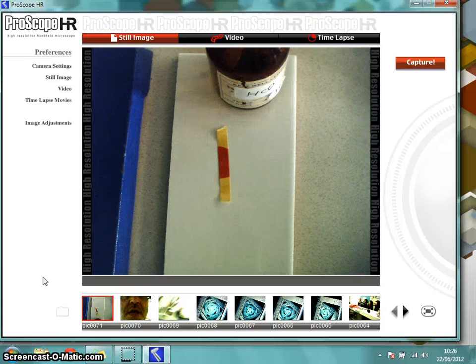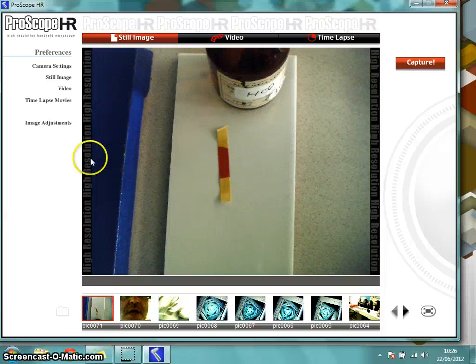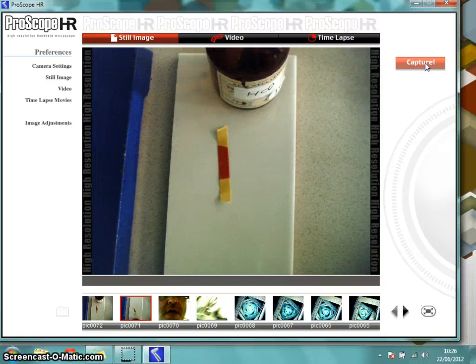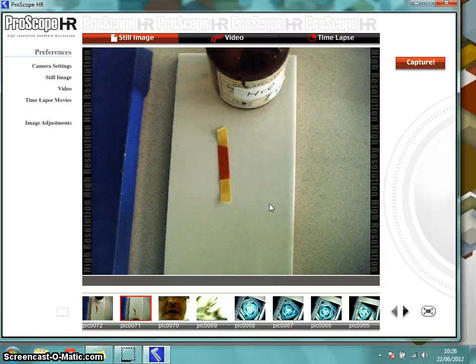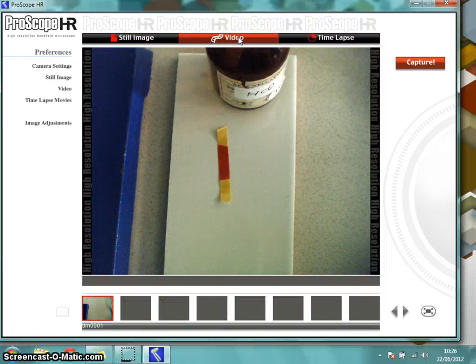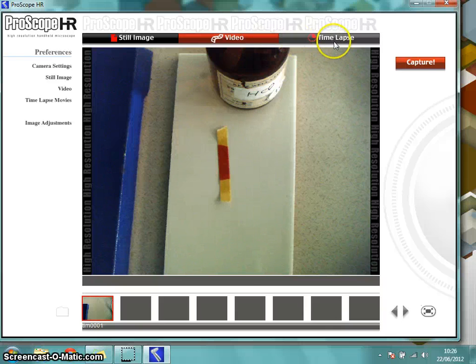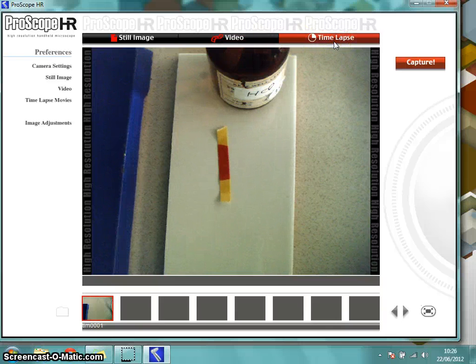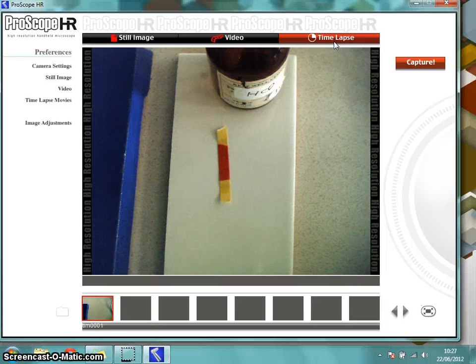Now just to look at a few of the settings in the software — at the top it says Still Image. If I click Capture, I've now taken a photograph of what we see in front of us. You can also use this to take videos or to do time-lapse photography, taking a picture every few seconds, minutes, or even hours over a longer period of time.